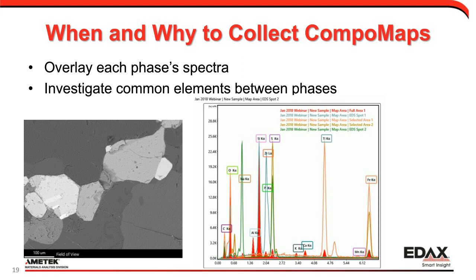It's similar to the sum spectrum because we have all the elements back in the list, but now they make a little bit more sense. We have silicon and oxygen, we've got iron and sulfur, and various combinations. What we have now is the benefit of looking at what elements are combined together, and we start getting an idea of what the compounds are together.